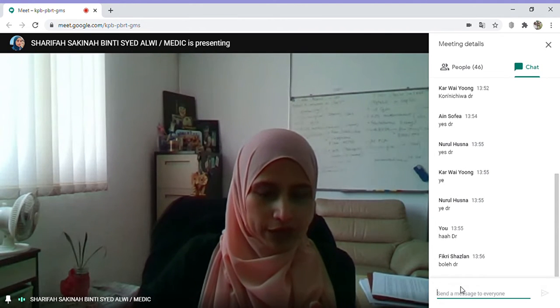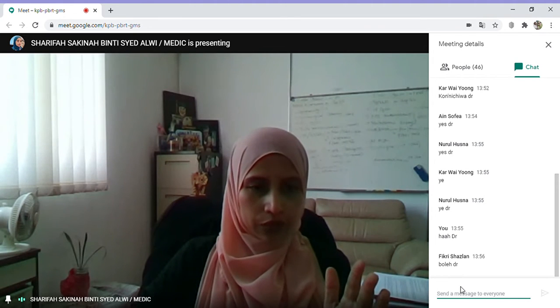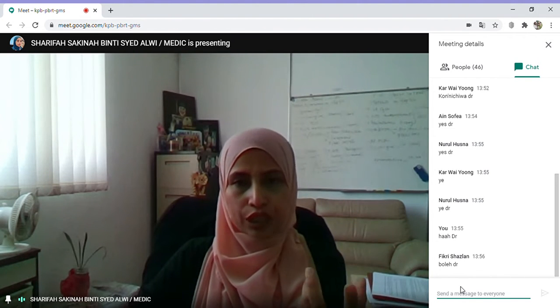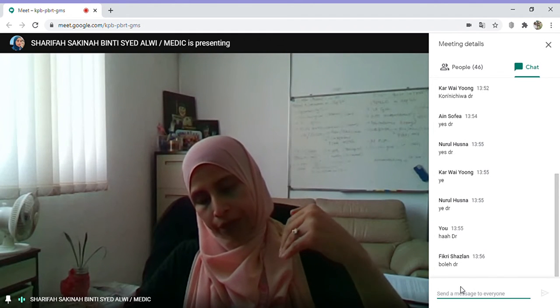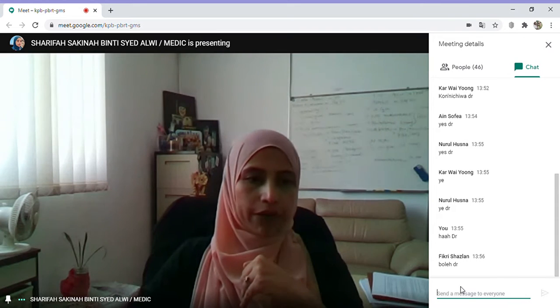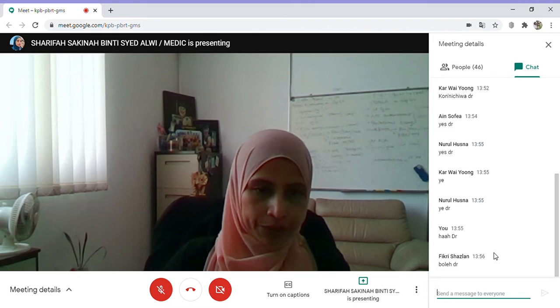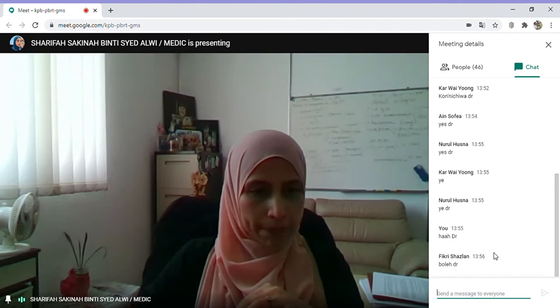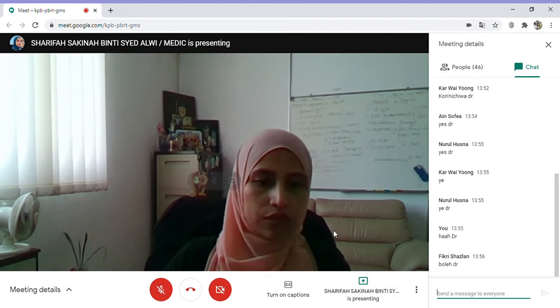So this is where the sample will come through, the flow cyto. The samples contain cells, and the cells must be in single cell form. Whenever the cell enters the flow cyto, always remember that it must be a single cell. This is the sheath fluid. The sheath fluid will be at this area and it will be scattered at this area. This is where your sample will be sucked into, and then it will pass through a laser beam. So this is the laser beam.